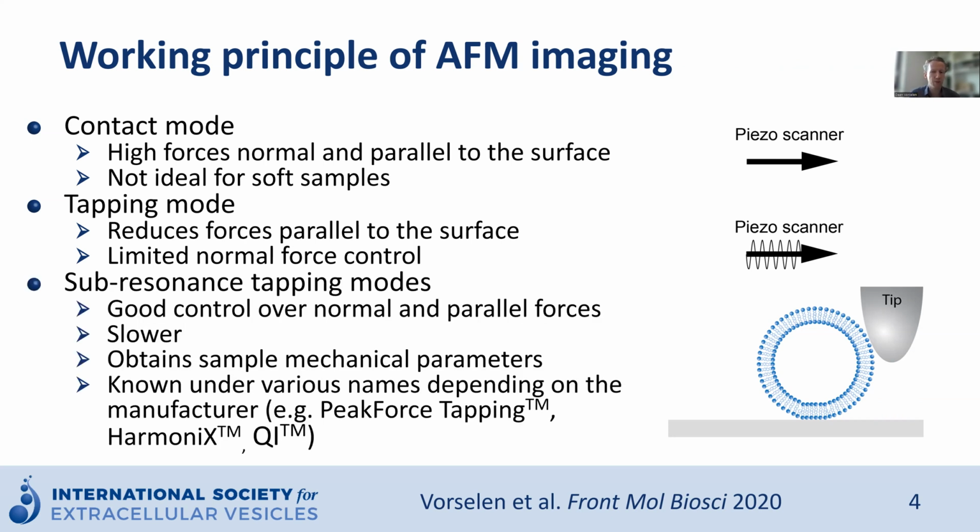A final mode that I would want to mention are hybrid modes, and they are called sub-resonance tapping modes. So these modes give you both good control over normal and parallel forces, and they work by still oscillating your tip or your cantilever, but below the resonance frequency. And now, why I call it a hybrid mode is because you still read out the deflection of the cantilever instead of the amplitude of the oscillations.